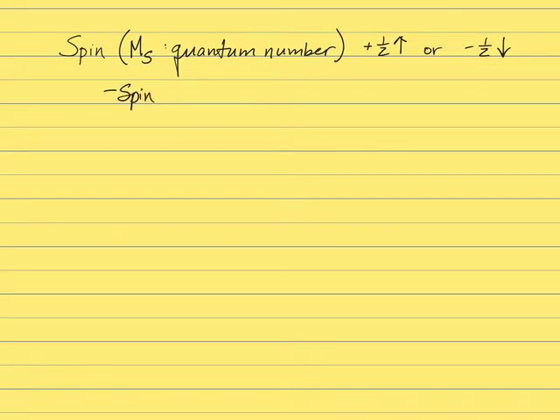So spin, which all particles, protons, neutrons, and electrons have, can interact with a magnetic field.